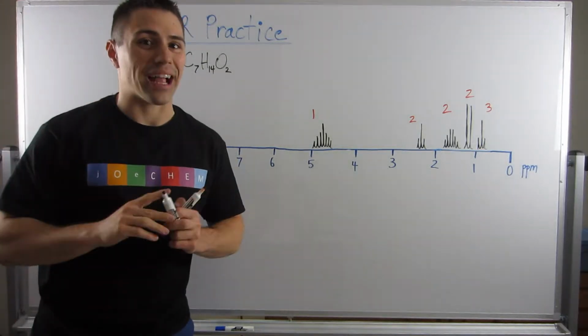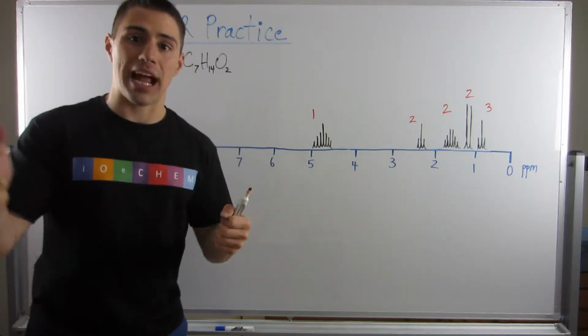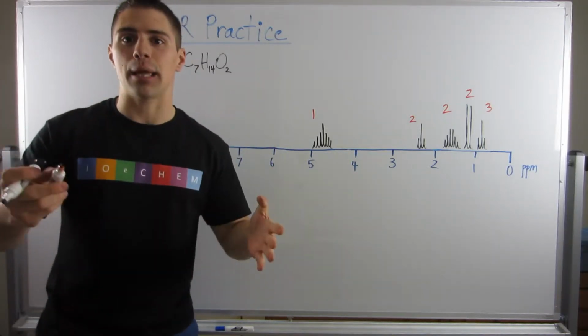Hey gang, welcome back. Okay, so this is our last video in the NMR series, and we're just going to practice. 3 times to be exact. So I got 3 examples for you.